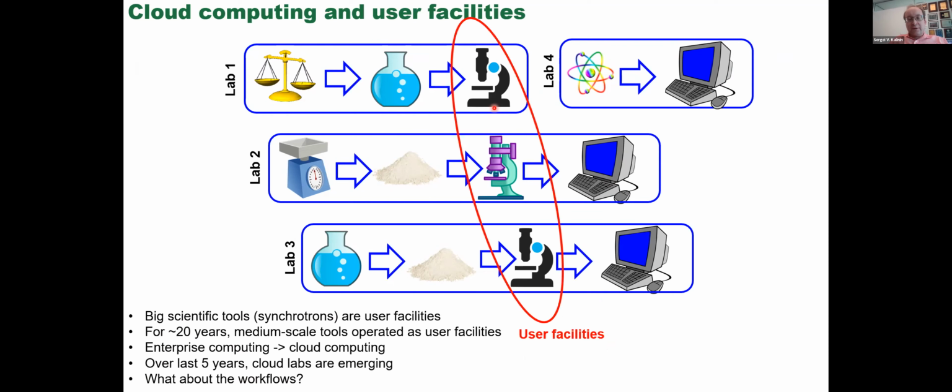So one example of it is the user facilities, right? There is an extra value in putting several electron microscopes side by side and having qualified staff working with them and working with external users to explore their data.